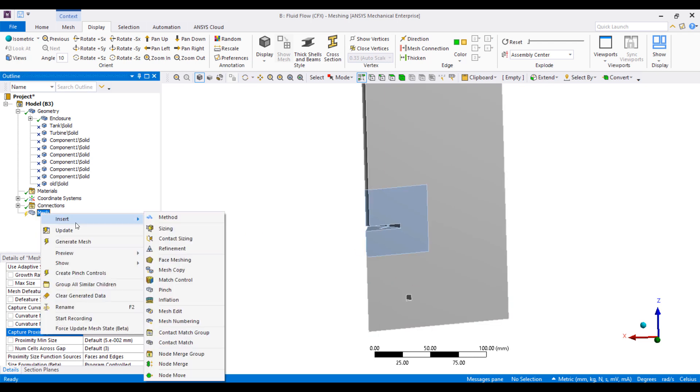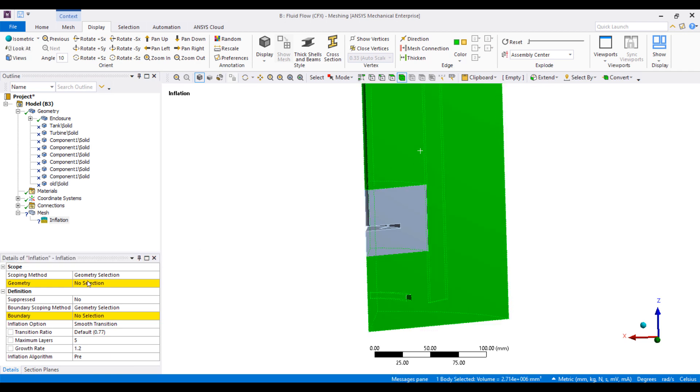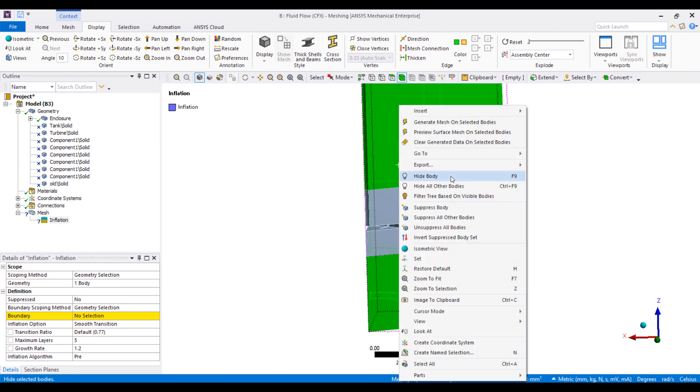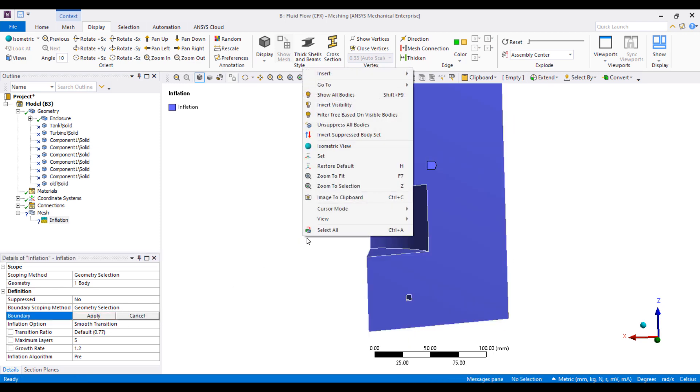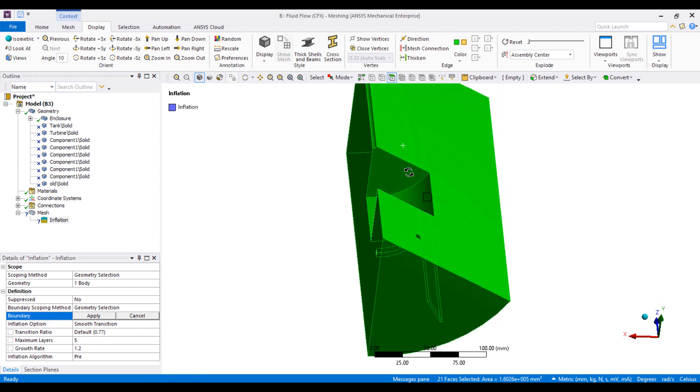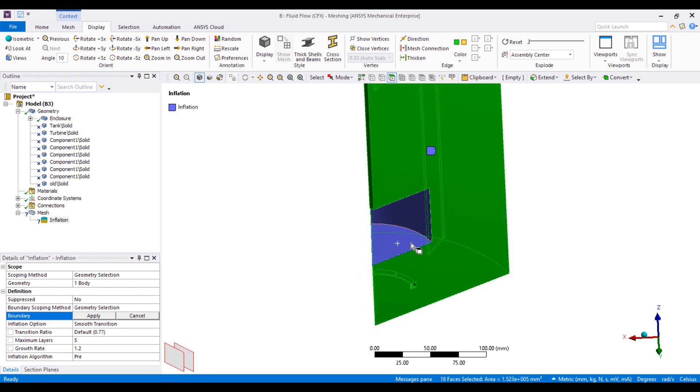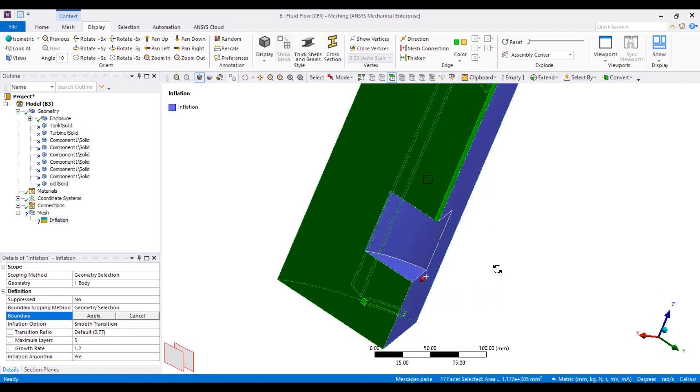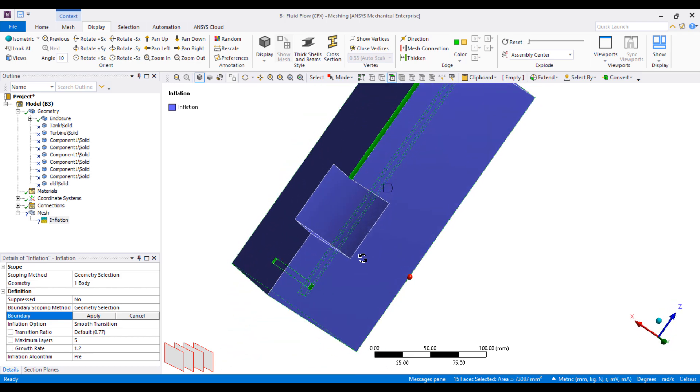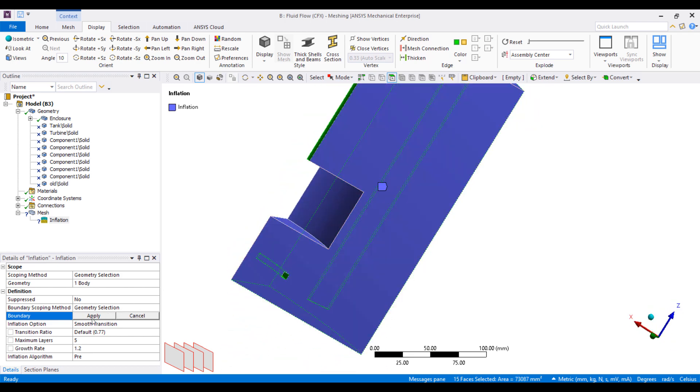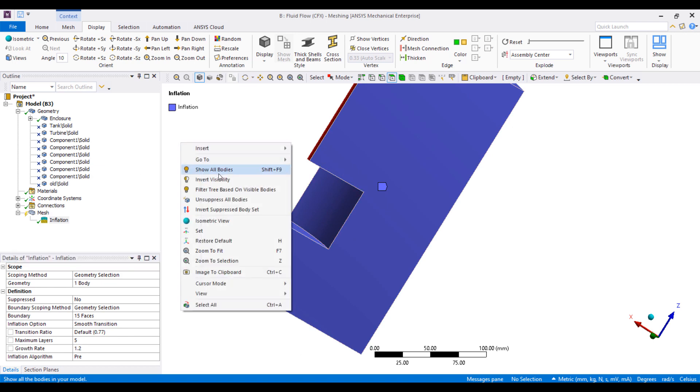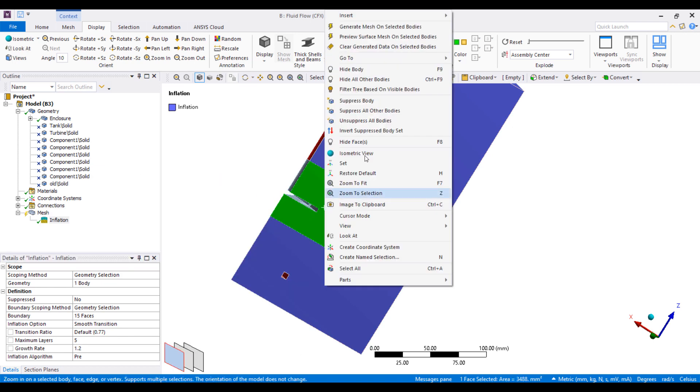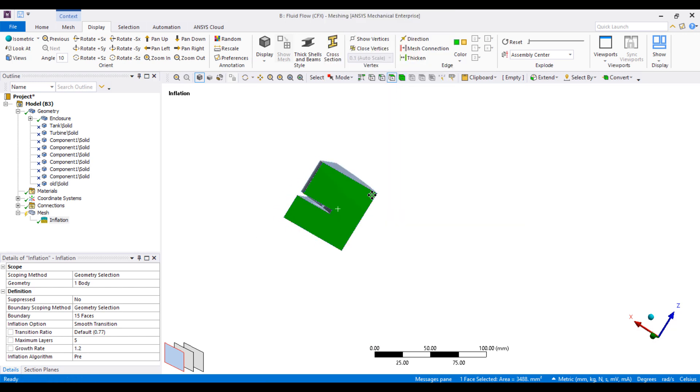Start the inflation layer on the stationary domain here. Let's hide all the other bodies, and we will include all of the surfaces and exclude anything that's not a wall boundary. So these are the areas where it's not walls.